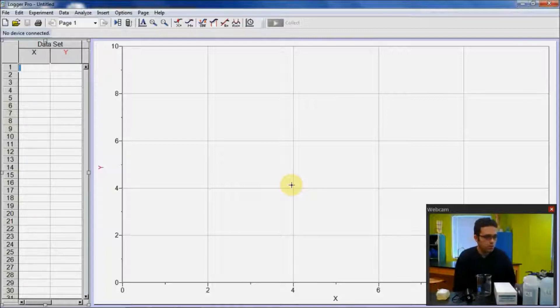I will go ahead and show you the materials. You will need a magnetic stirrer for this. So this is both a hot plate and a magnetic stirrer. There's a ring stand attached to it and you will need a clamp to secure your conductivity probe. You will need a beaker, this little magnet to stir the solution in your magnetic stirrer, and a conductivity probe. I use Vernier. You can use any other data collection system. There's this interface to connect your probe into your laptop called Golink. There are a couple of other interfaces that Vernier uses. I'm going to use this.